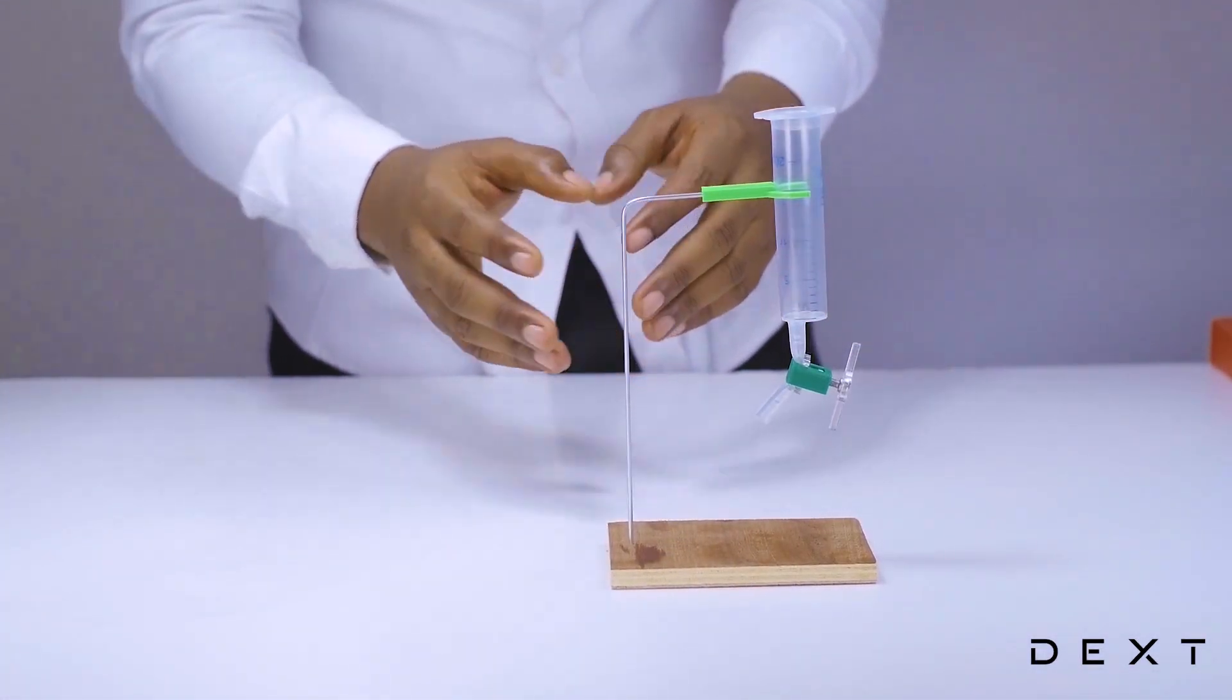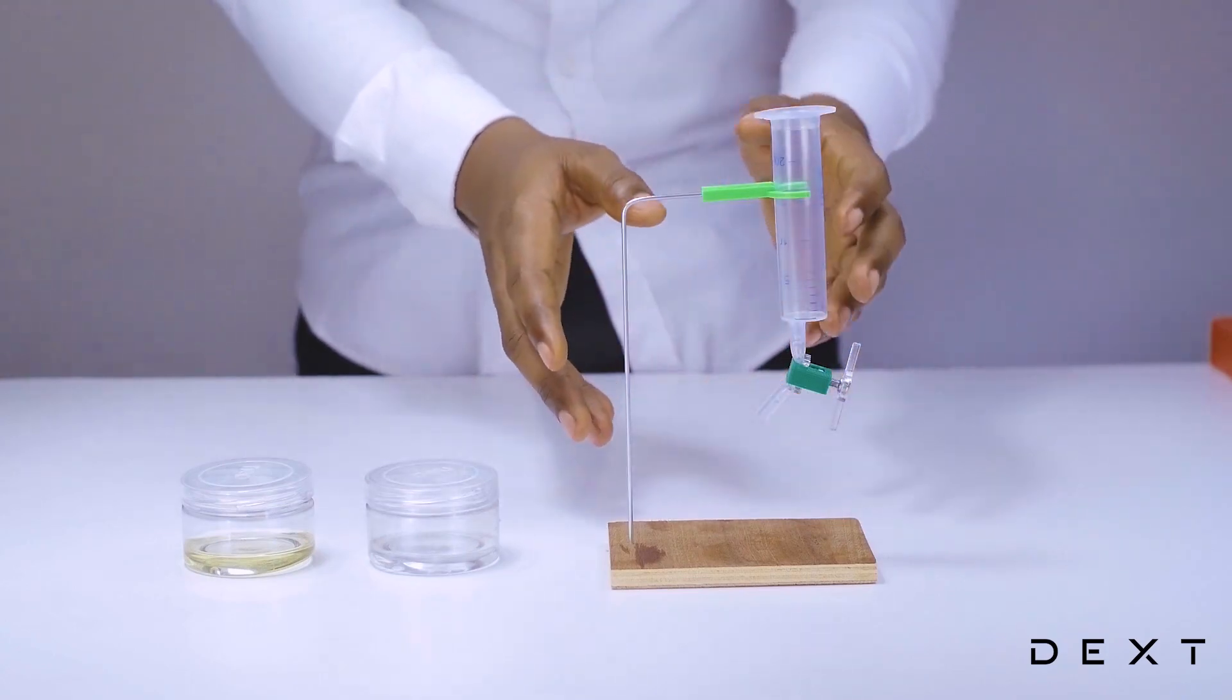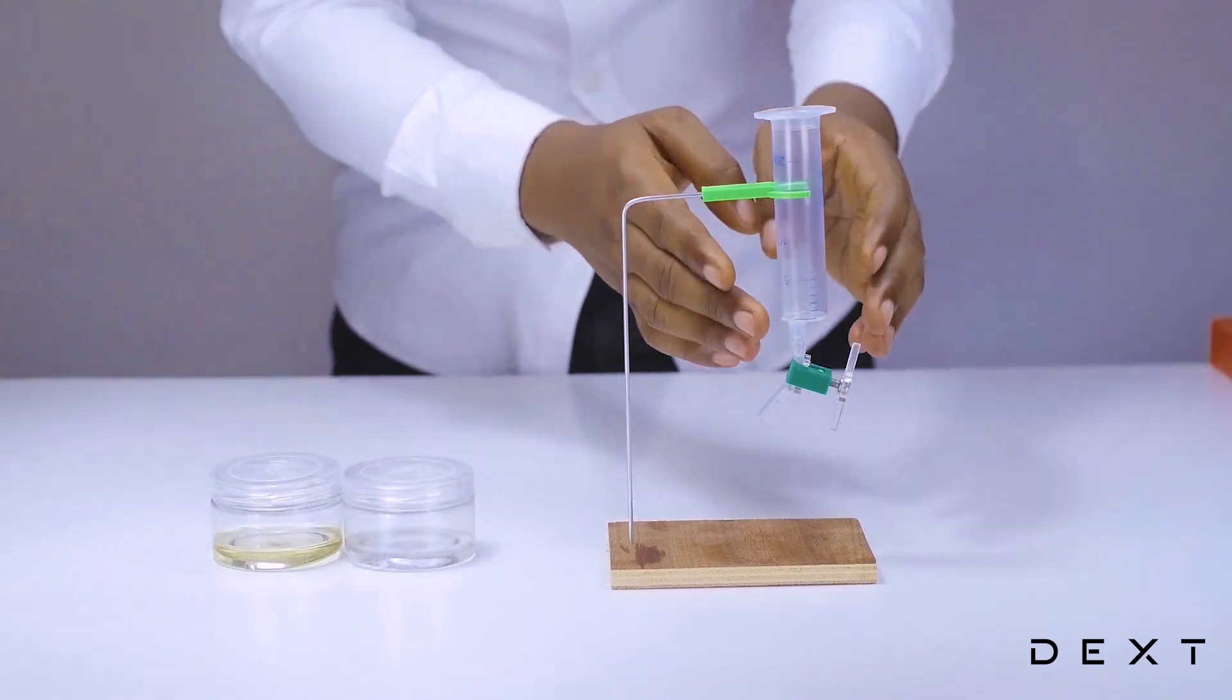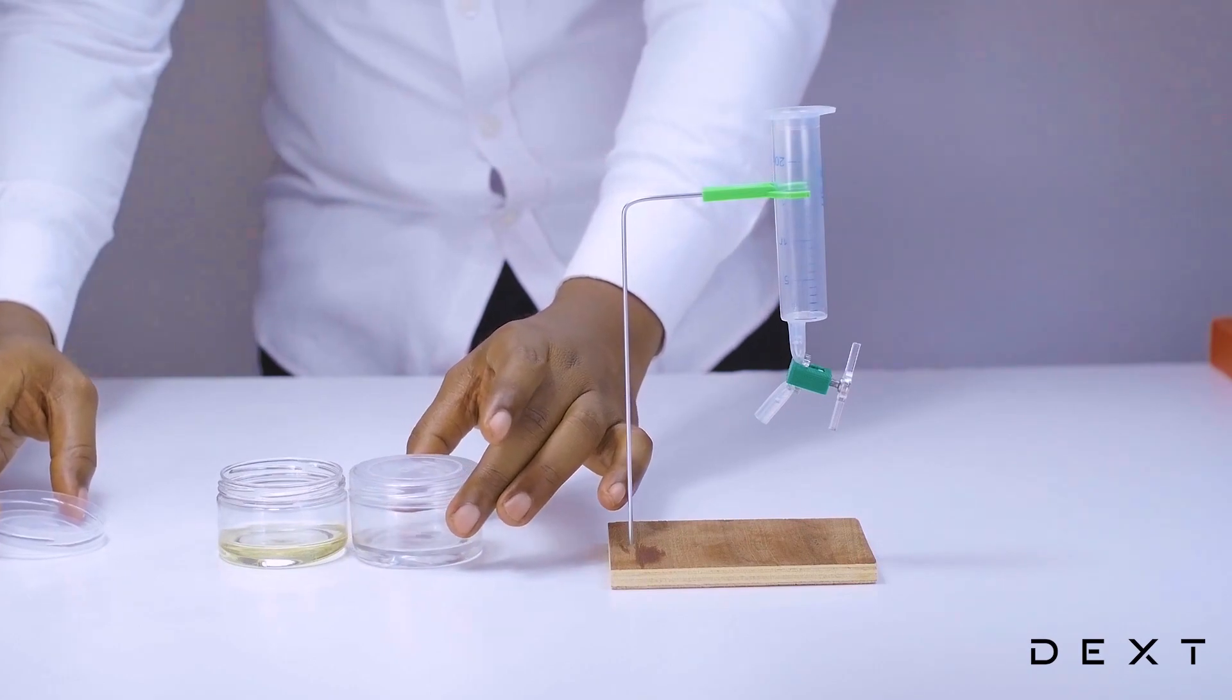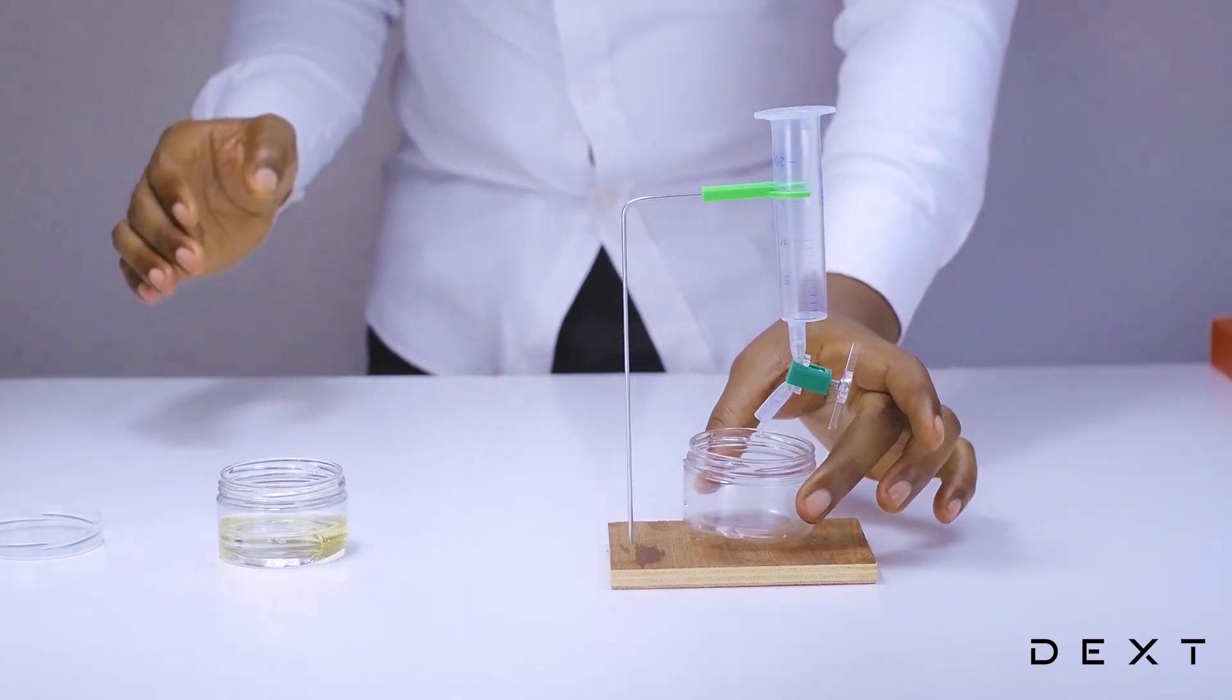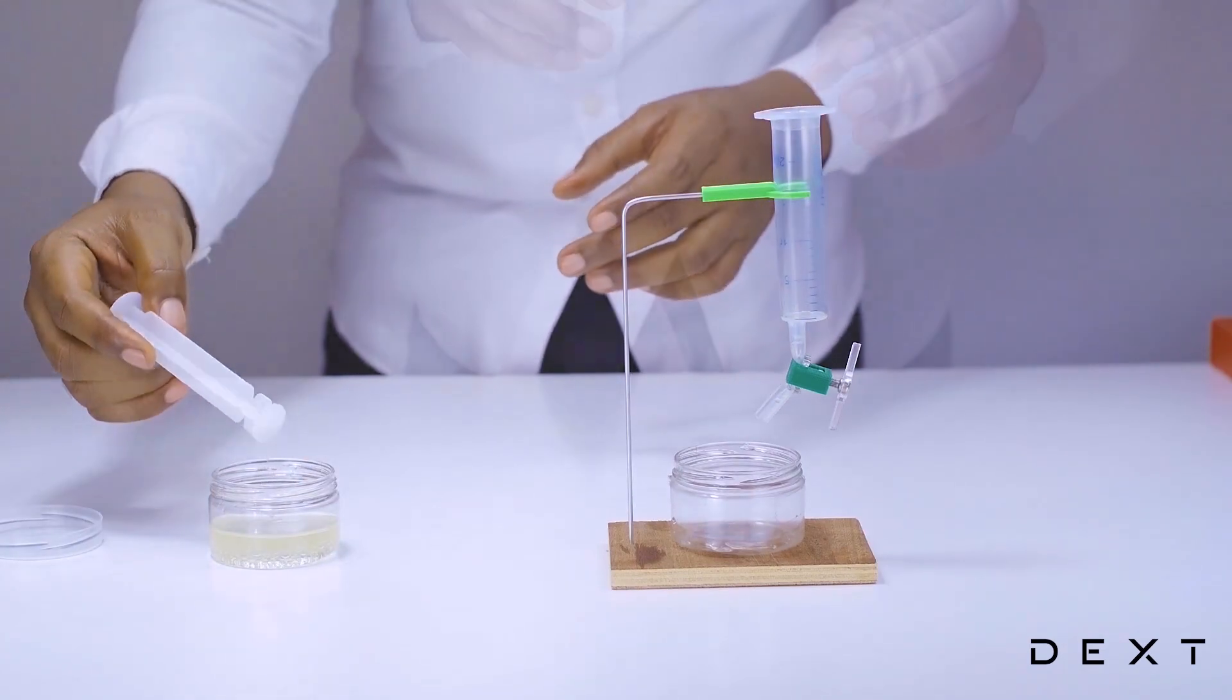Now that we have our setup done, we are going to bring in some liquids. So we have some water and some oil that we are going to use. We are going to mix these two up in the right proportions, and then try and separate them using the improvised separating funnel. So we simply pour the water into the oil, and then we are going to try and mix it with our simple plastic piece.